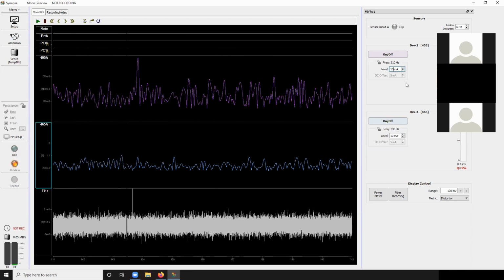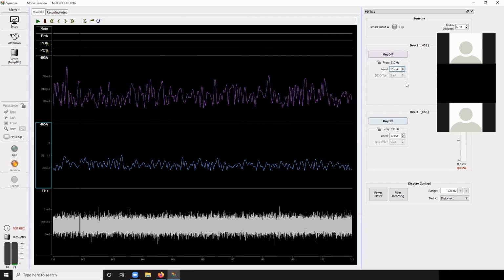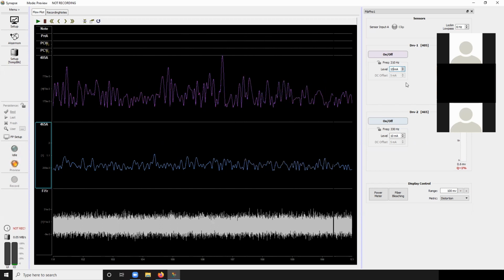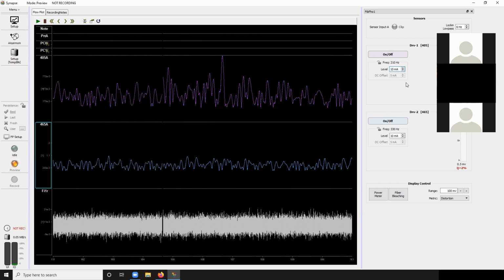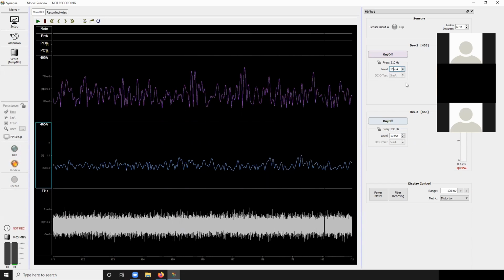So what we want to do first and foremost is get an idea, roughly, of the power that we're going to be using at the tip of our fiber. In the Lux cable kit, there should be a 400 micron FCFC patch cable, which you can hook up to your sample port of the Minicube and then plug the other end into the PM1, which is on sensor D of the RZ10X. This is just going to give us an idea roughly of what the power is.